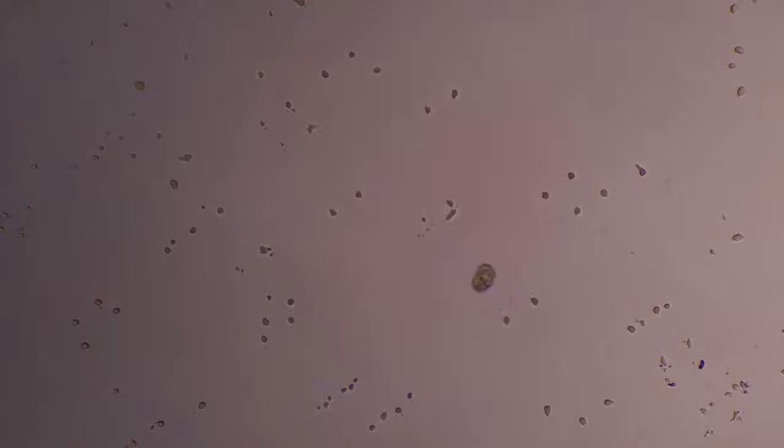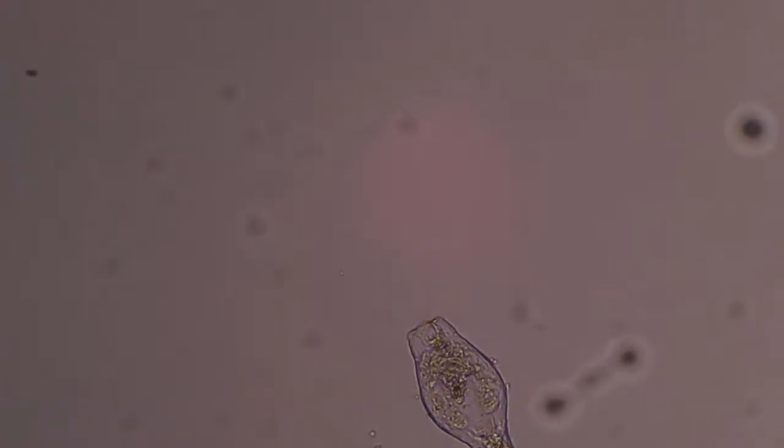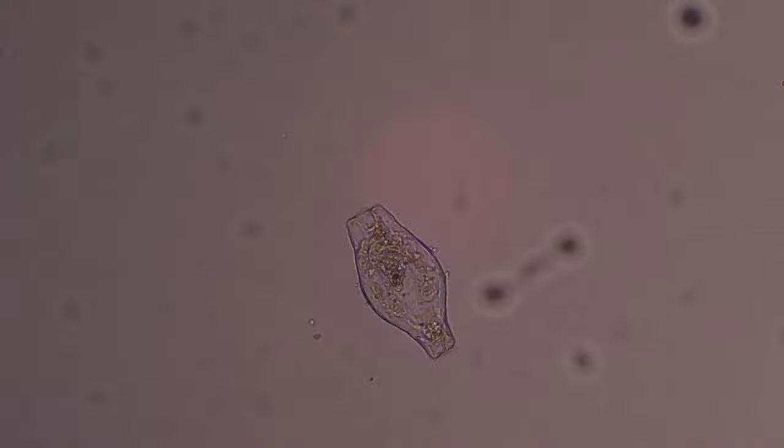And the little kidney beans are back. It's very popular, these little kidney bean guys. Well, there's a dead rotifer. Can tell by that kind of a vase shape that they have. So yeah, when they die, they kind of tuck away like that. A lot of ones I found are like that. They're not stretched out usually. But sometimes they are.